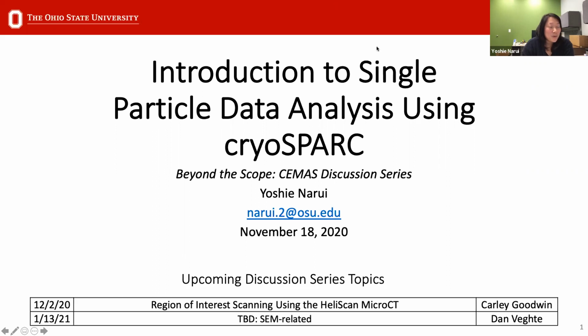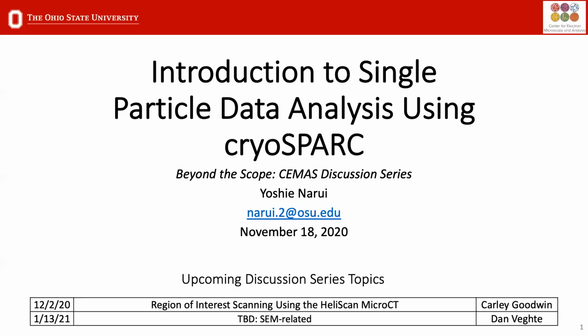I'm going to go through a tutorial that CryoSPARC has put out, but I think it's useful to walk through that with people so they have an idea of what's involved. I'm going to stop my video and switch between my presentation and actually showing you in CryoSPARC how to do certain things.